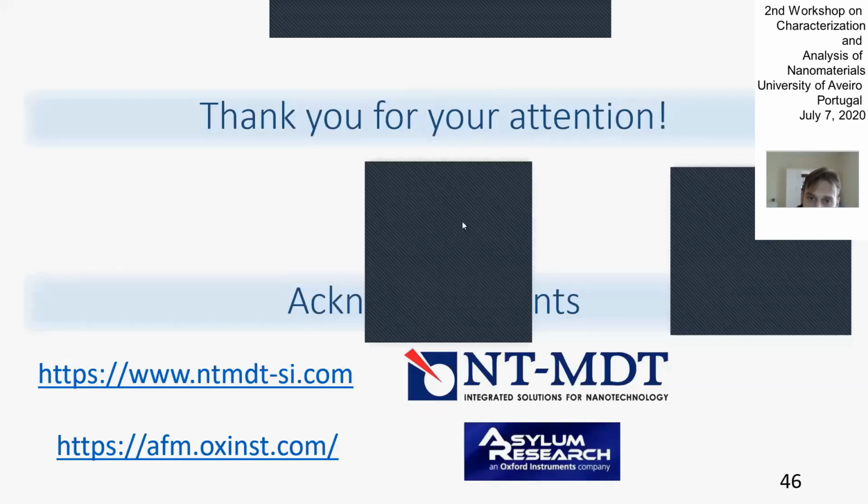I think it's done in high vacuum conditions. It is possible, I think, in the Omicron systems to go with really small resolution, but my experience is mostly in working in normal conditions without strict control of the vacuum. If you work with Omicron systems in high vacuum, you will not react with the atmosphere, and if you carefully control the forces, in that case. But what is your opinion? The last question: how do people go to atomic resolution? On extreme resolution, I think this is not possible.